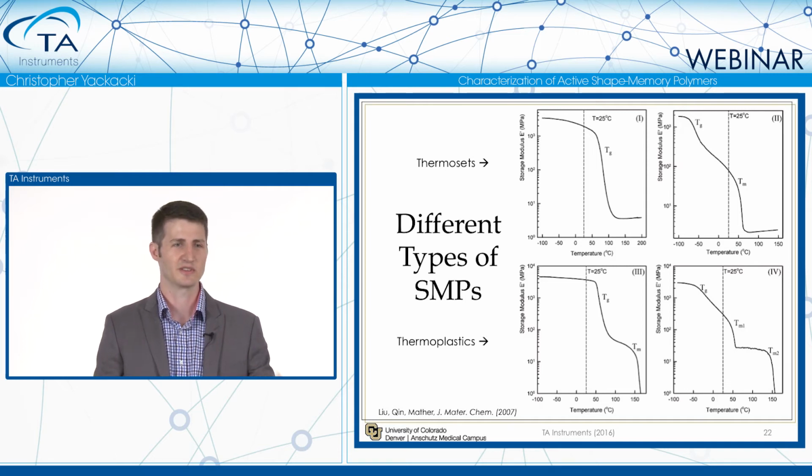And so in the first case we have just a thermoplastic, and in the second case we can have our block copolymer thermoplastic as well. So we have these 4 different types of materials that we could use as a shape memory polymer that we could identify very quickly just by running one glass transition test with these instruments.